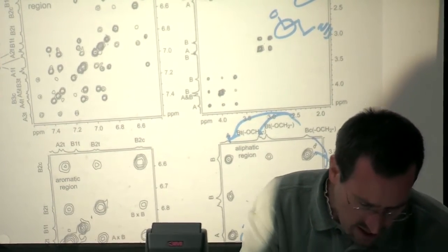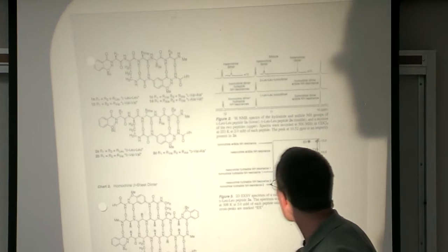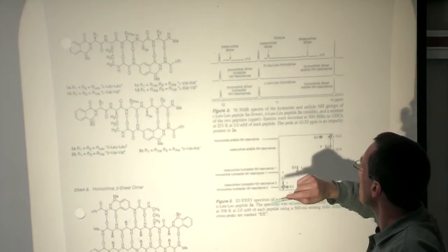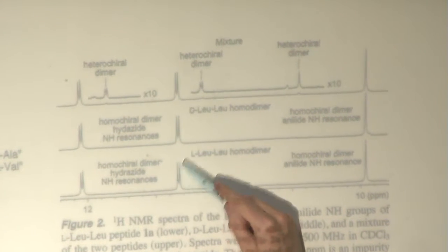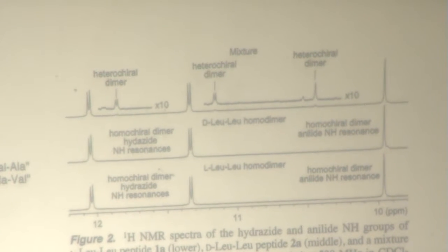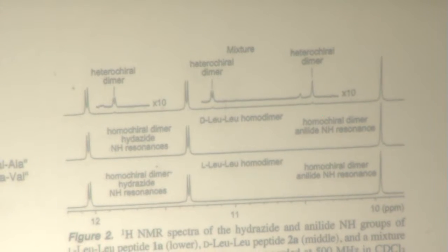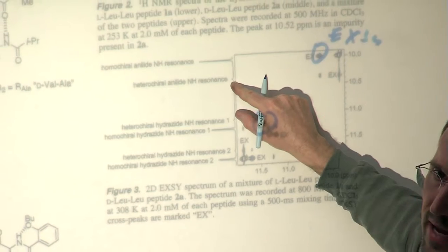The other paper was a similar thing. It was an equilibration among 2 different species where he's looking at homo and heterodimers, and he mixed one enantiomer and another enantiomer, and this was Michael who did this, and saw some very teeny tiny new peaks in the mixture. So this is one enantiomer, the other enantiomer, and he saw these little tiny peaks, and he wanted to establish whether that was a diastereomeric heterodimer. So how do you do that? You can say they're new peaks, but what are they? So you show that they're in exchange. So again, he ran the NOESY or ROESY sequence and was able to see exchange cross peaks here to show they're in exchange. And you notice he picked his temperature so that his peaks, which are normally sharp, he warmed it up just a little bit to make the peaks a little broad.